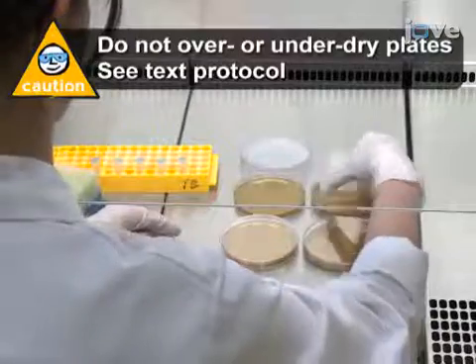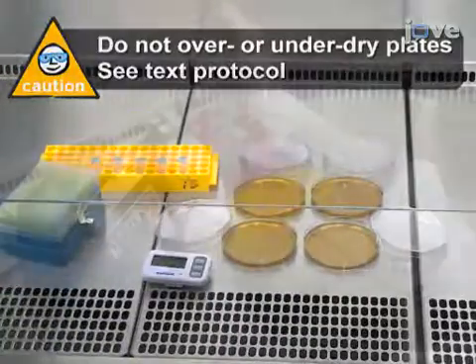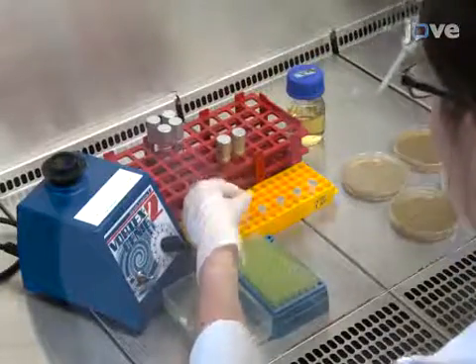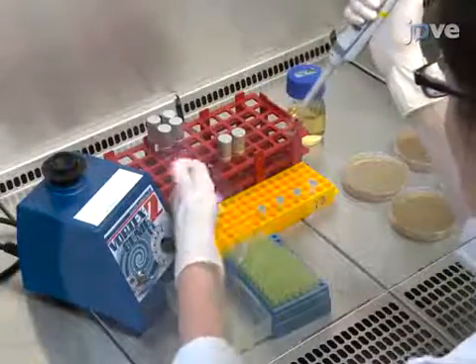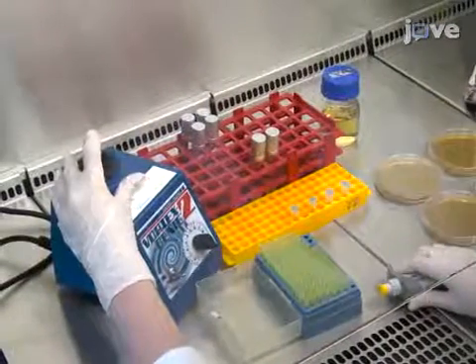First, place the 2xSG agar plates in a laminar flow hood for 15 minutes to dry. Next, add 100 microliters each of the green and red fluorescent protein-producing biofilm strain B. subtilis 168 starter cultures into a 1.5 milliliter microcentrifuge tube. Vortex the tube for 3 seconds.